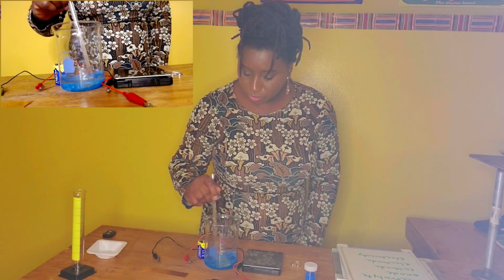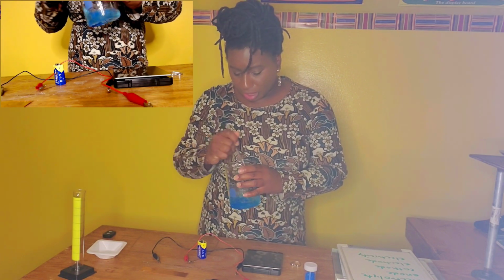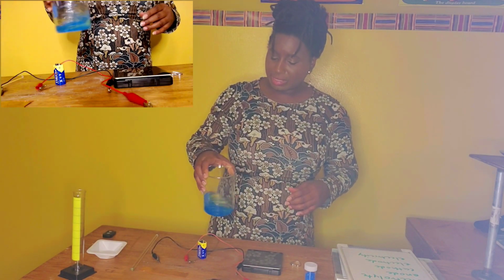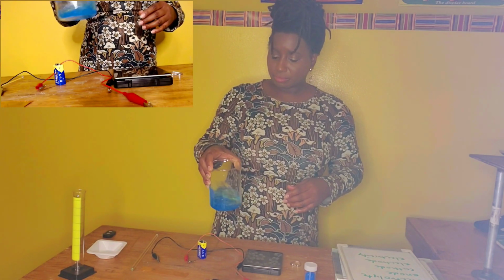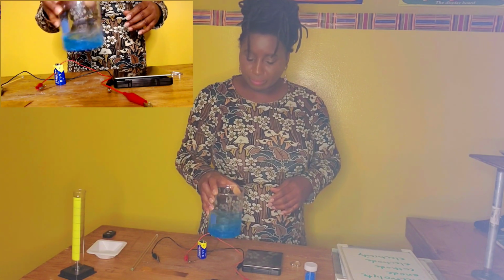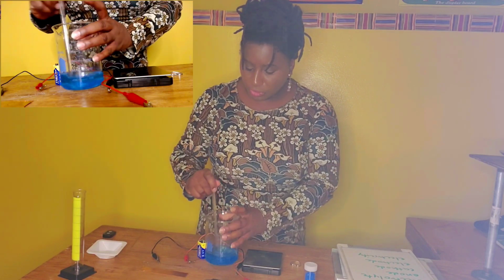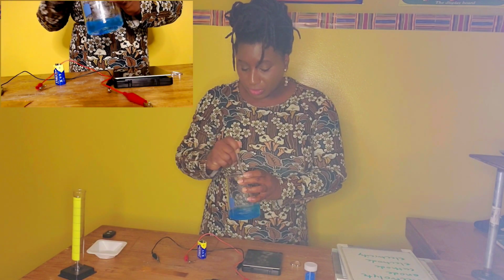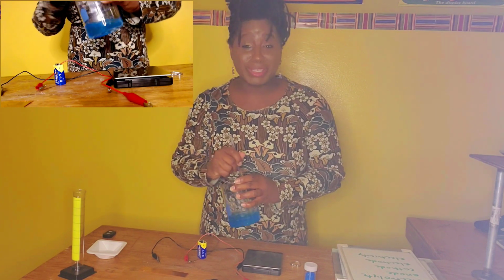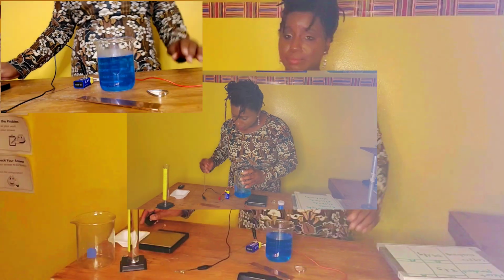Now I'm starting off with a cold water solution. It will take a little bit longer to dissolve, but it will get there. And in fact, I'm gonna give it a good little swirl for right now. It's best done in an Erlenmeyer flask. But we're gonna let that dissolve. It's getting there, as you can see. Yes, so now I'm going to stir it up. To speed up the process of dissolving, it would be best for you to start off with a warm solution. Heat it up just for a little bit, otherwise you'll be stirring quite a while like me. No worries, it's dissolving. Let's take a closer look, it's dissolving.